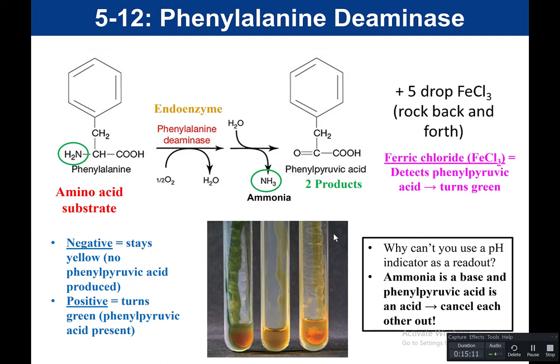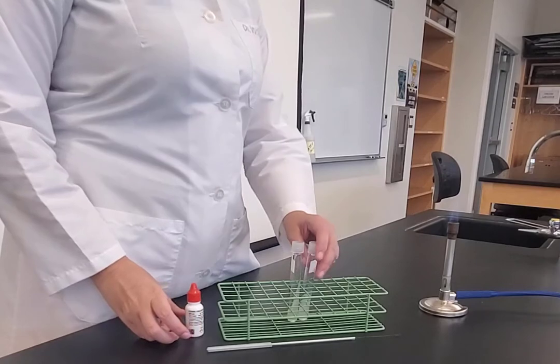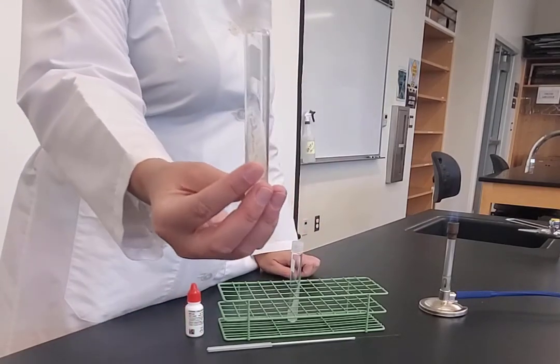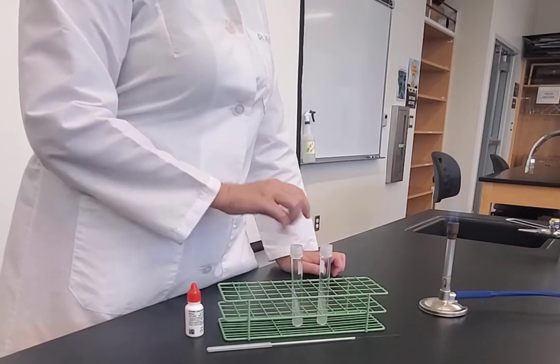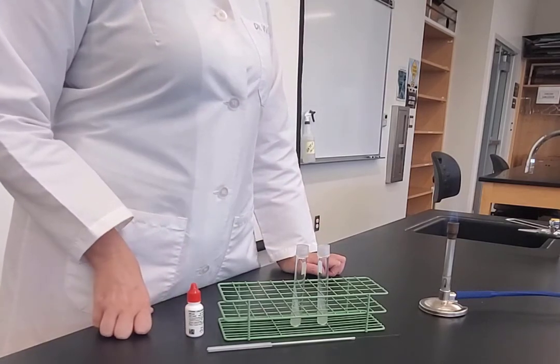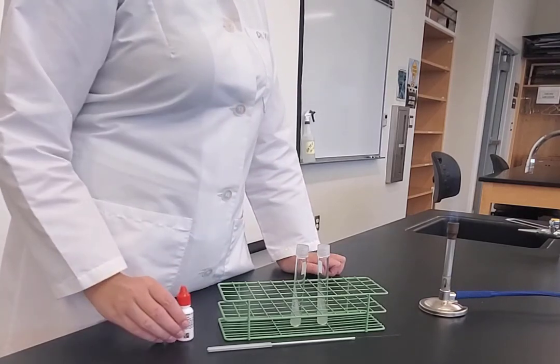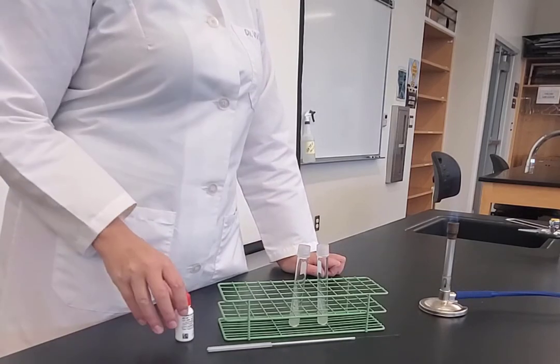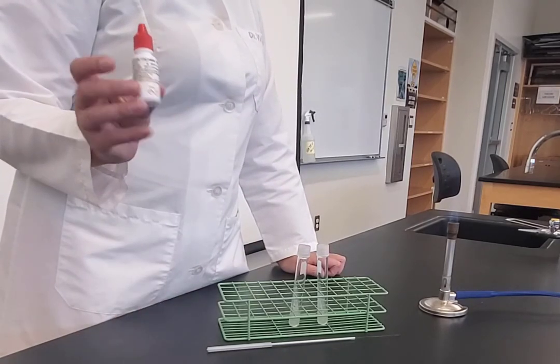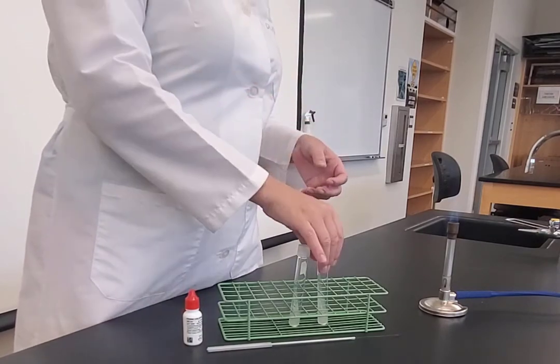Here's the video of adding ferric chloride to the slant. We have our two bacteria growing on phenylalanine slants — Proteus mirabilis and E. coli — already inoculated and incubated. To detect if phenylalanine is deaminated, we use ferric chloride, which detects phenylpyruvic acid, a product of phenylalanine deamination. I'm going to add five drops of ferric chloride to each slant, then rock them back and forth to get it onto the slant.